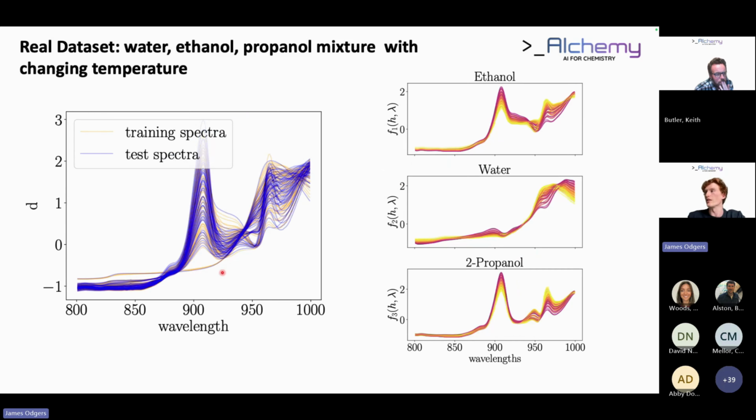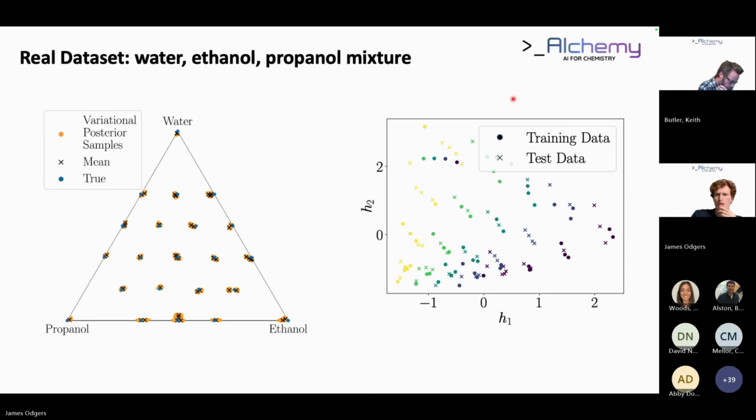And then we also applied this to some real data, and we were able to, once again, take a real set of data with some mixture of training data where you know what's in it and test data where you don't. And we're able to spit out these three physically understandable pure components. Likewise, we're able to get good estimates for what the pure component weights were.